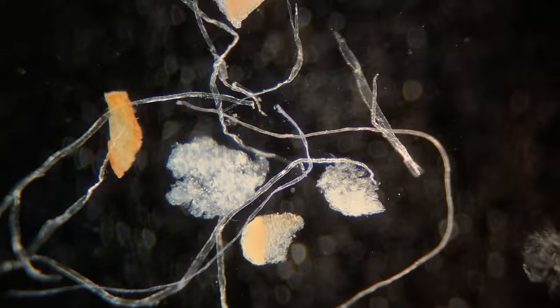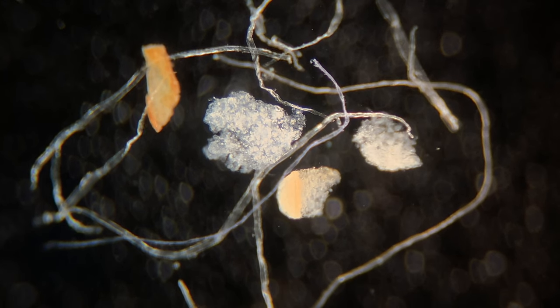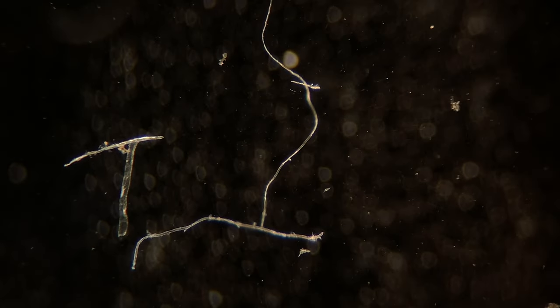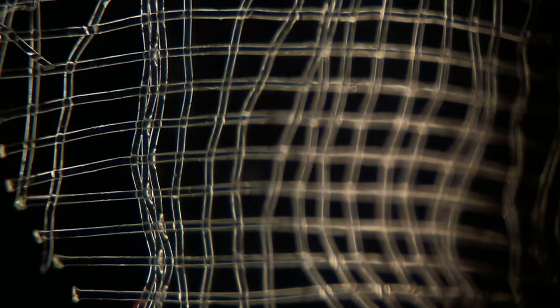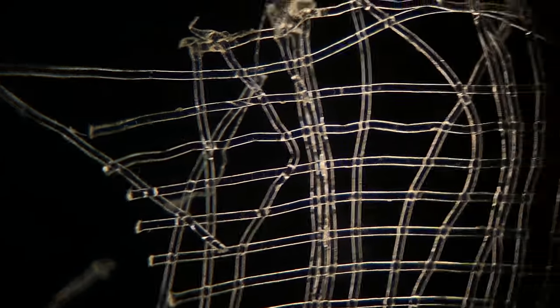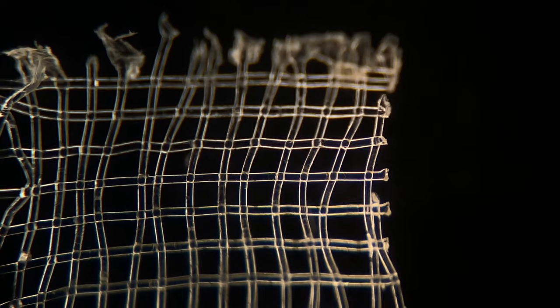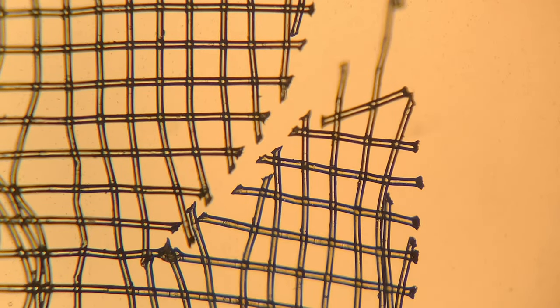At the very high grade technical level there are multiple ways to do this, but at the citizen science level with limited funding, this is basically what we've got: a compound microscope. We look at the mesh before and then after. All of these things pretty clearly look like fibers to me. Here is the mesh again but this time under dark field — this is the uncooked one, so you can see they're all still pretty well together. One thing I'm still questioning is the method in the study where they cut the bags open to remove all of the tea leaves. They did this because certain tea leaves have oils that would interfere with their imaging. But take a look at this — this is where I had cut the tea bag, and as you can see, these tiny little fibers could easily fall off into the sample.